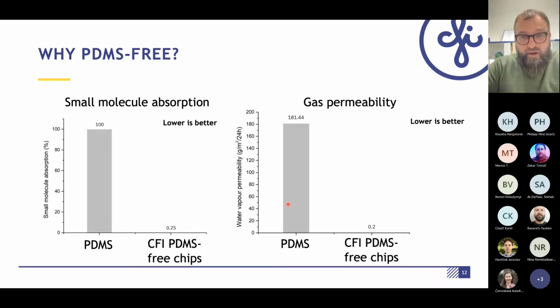But in some cases, if you want to grow some specific cells, or you want to maintain some specific air condition in a chamber, then you need to develop a PDMS-free chip.